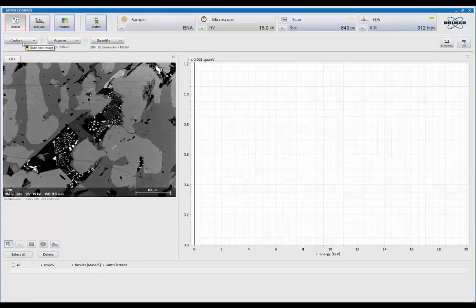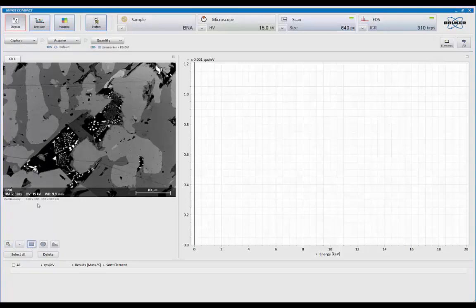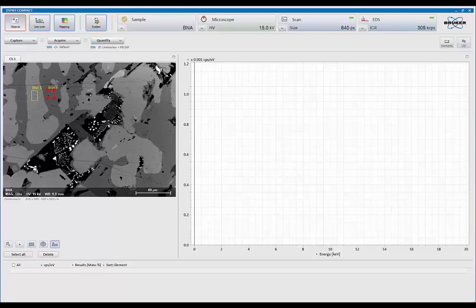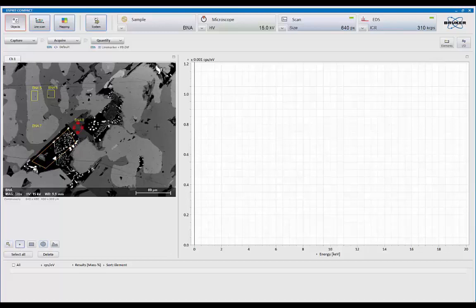Clicking on capture again stops the frame since I was in continuous mode. Using the annotations down here now, I can come in and say I want to collect a spectrum from this region here, from this region over here, from this polygon in here, from this ellipse in here, or a set of points.